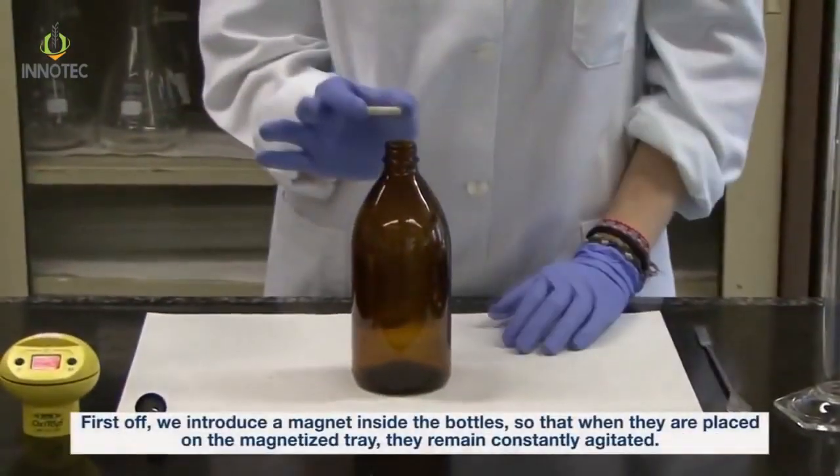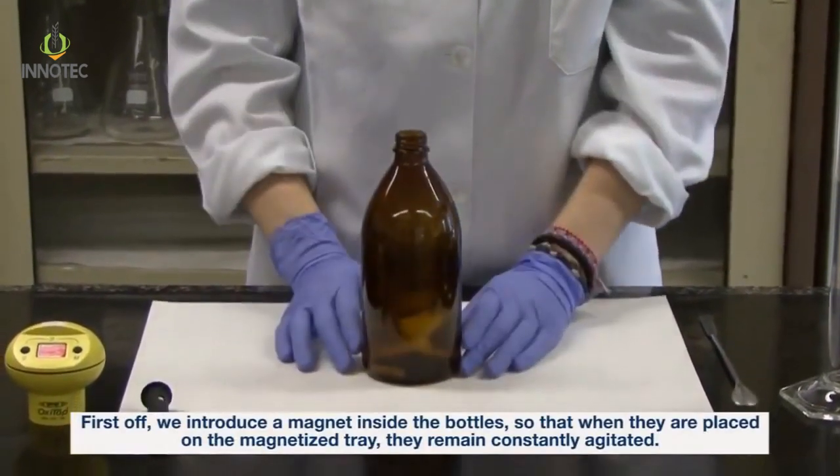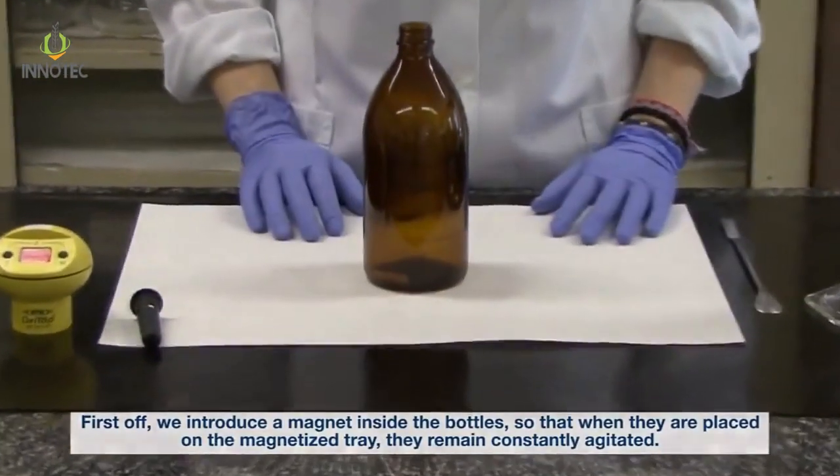First off, we introduce a magnet inside the bottles so that when they are placed on the magnetized tray, they remain constantly agitated.